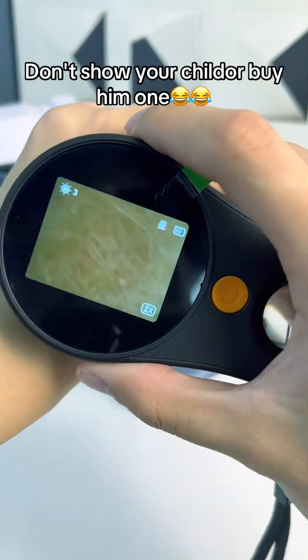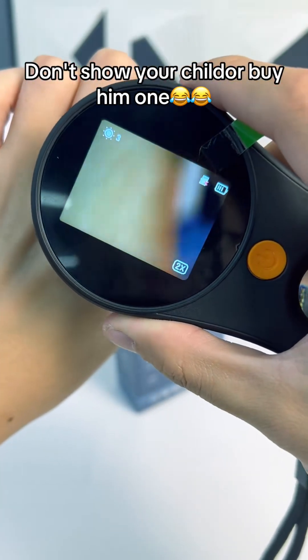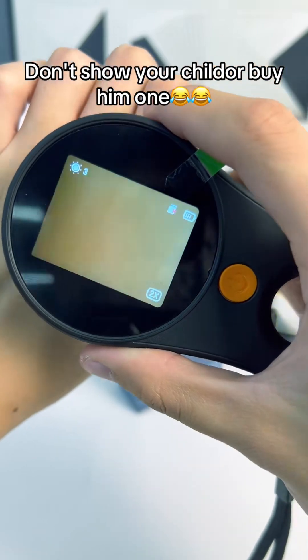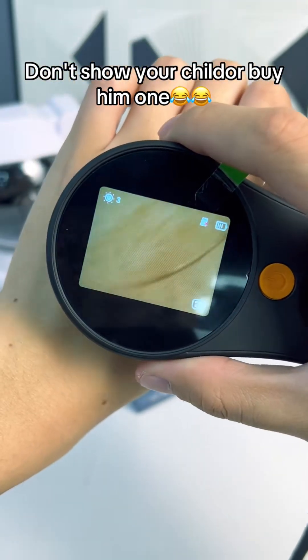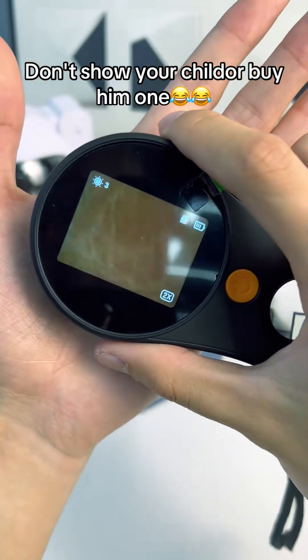You can even look at your skin. We've been looking at our skin. You can see your hair there. I've been looking at my tattoos and stuff — that's pretty cool. You can look at fabric, look at the threads, coins — you name it.